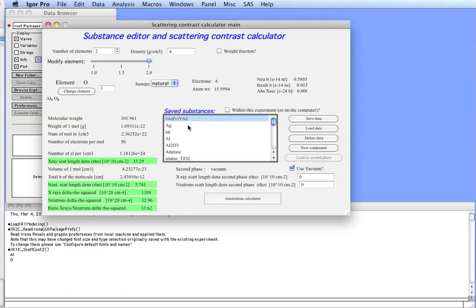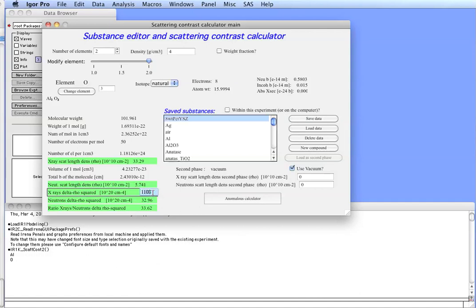So, here we can calculate, here we can load the parameters. Now, let's assume you have aluminum oxide and vacuum. Vacuum would be, for example, voids because they typically have a density of vacuum. So, you would have voids in aluminum oxide. In that case, your free electron approximation contrast is about 1110 to the 20 cm to minus 4. For neutrons, you have 32.96, and the ratio between x-rays and neutrons is about 33.62.